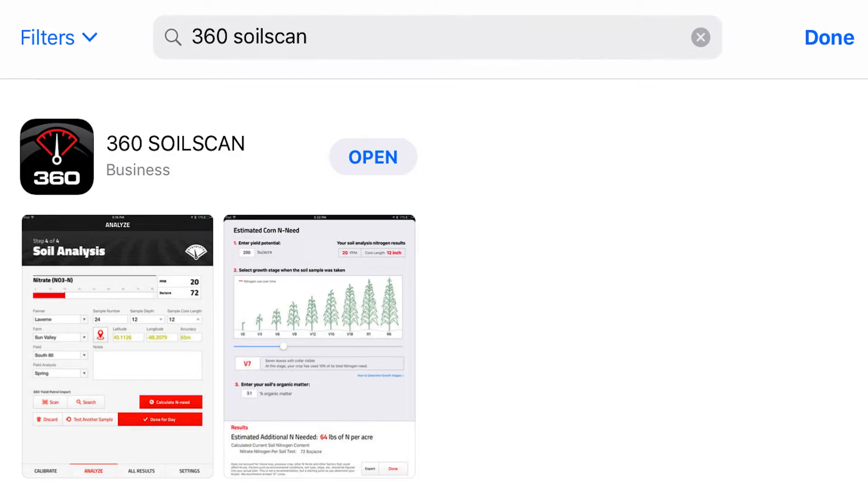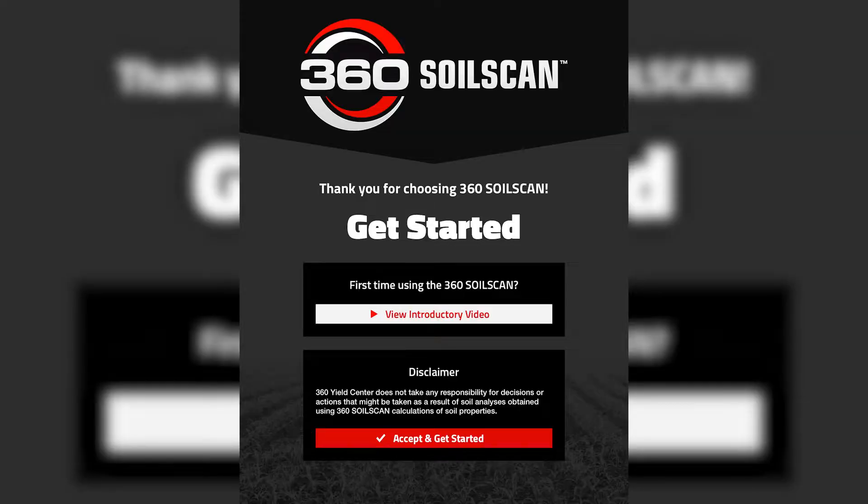To use a 360 SoilScan you'll need to download the 360 SoilScan app. This right here. And that's what will be used to run the SoilScan.